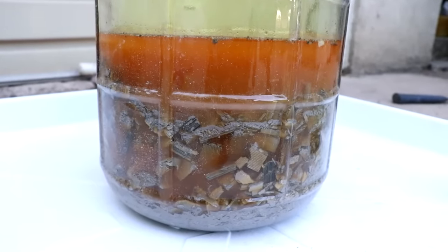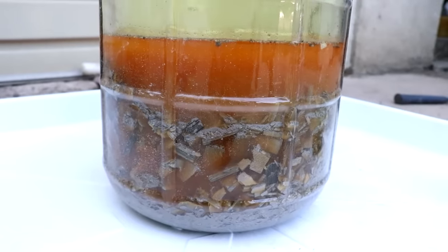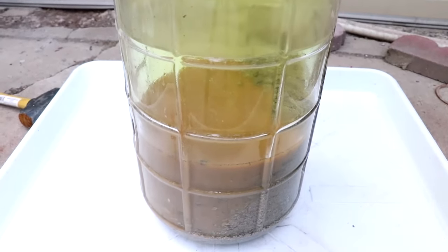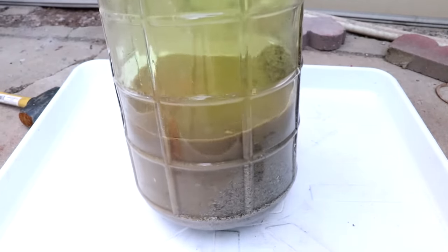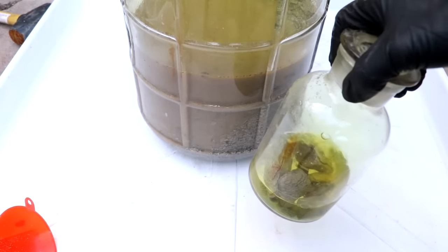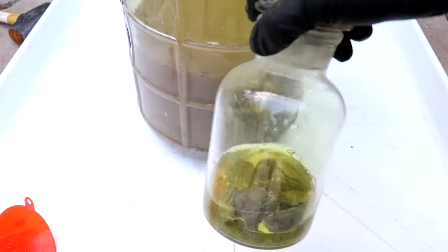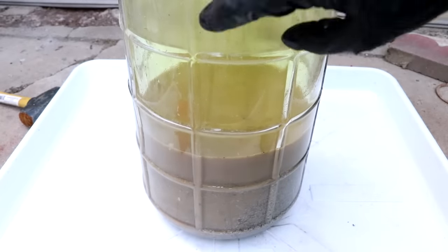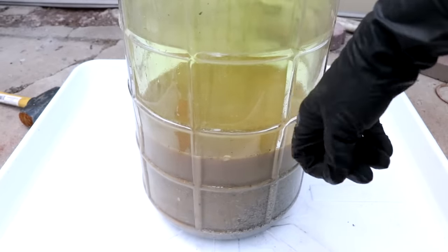I can already see that the solution is changing color as it dissolves those precious metals — that's a good sign. I'm going to leave this sitting either outside or in my fume hood for about a week, because in my testing I found that after about a week is where I stopped recovering any more metal. Chlorine's some nasty stuff, so I definitely don't want to store this anywhere where I'm going to be living.